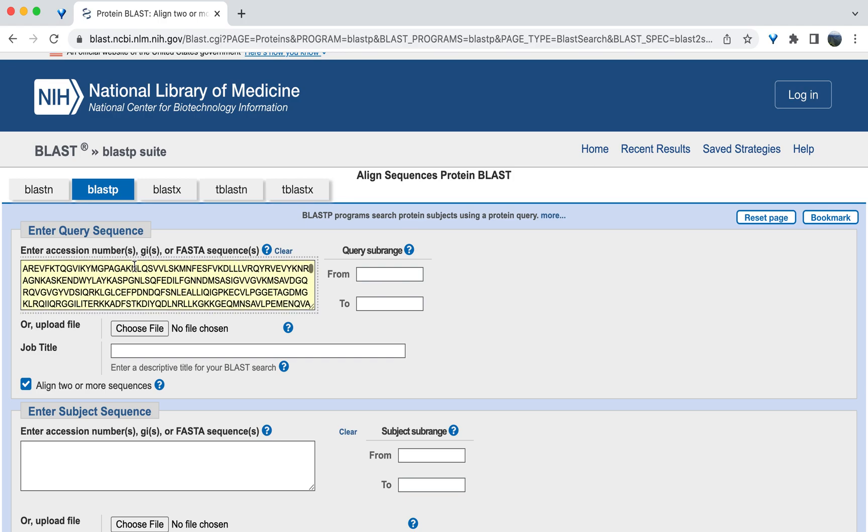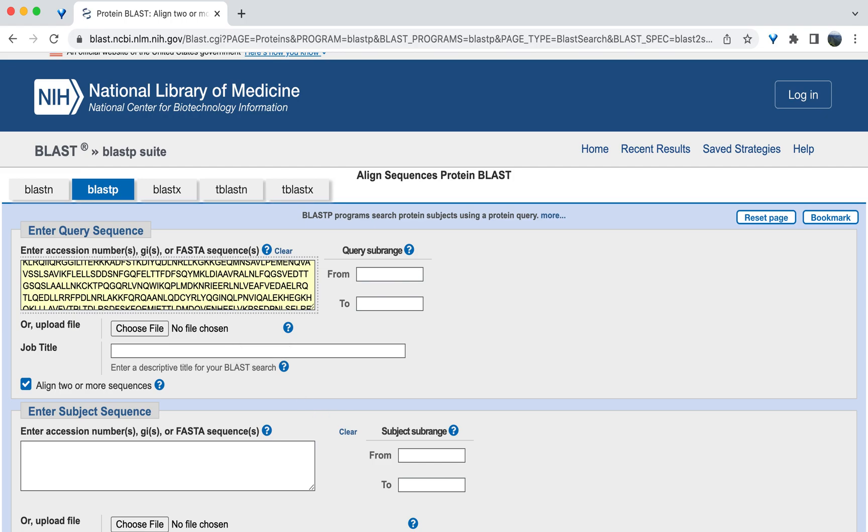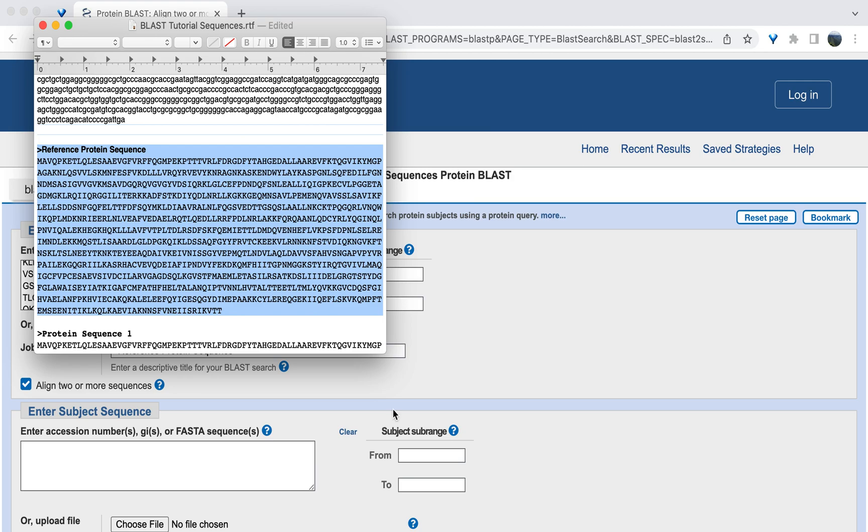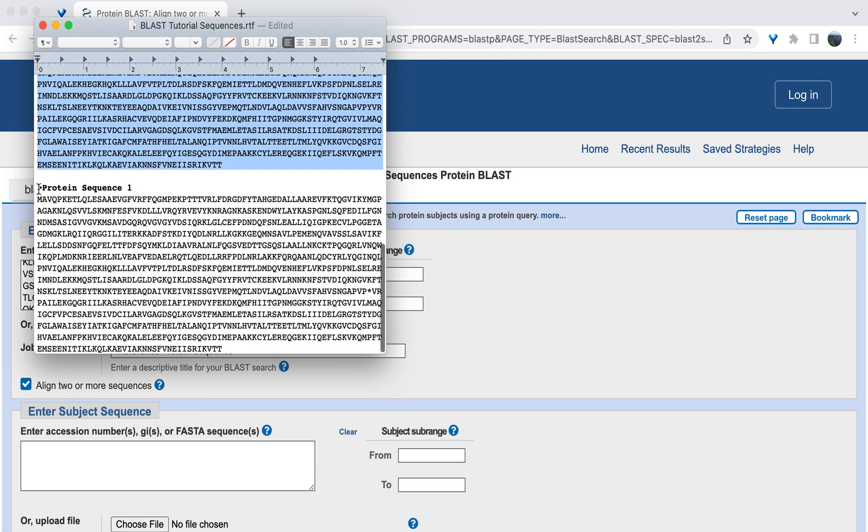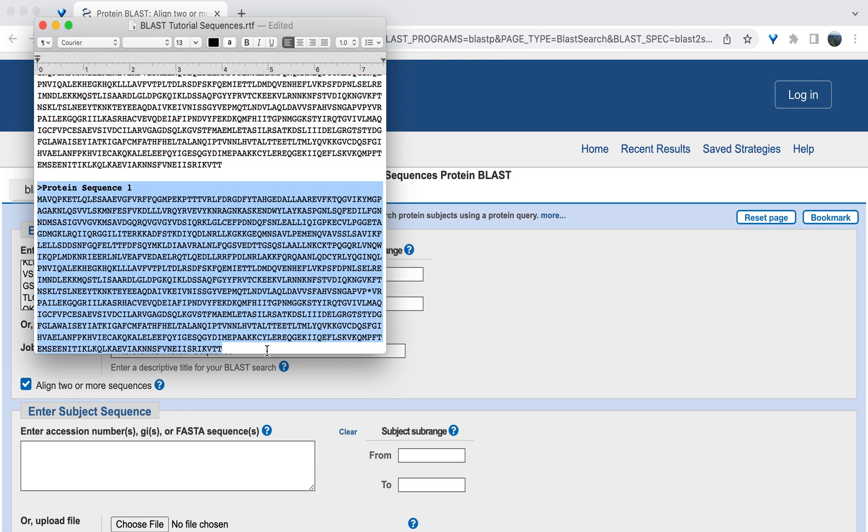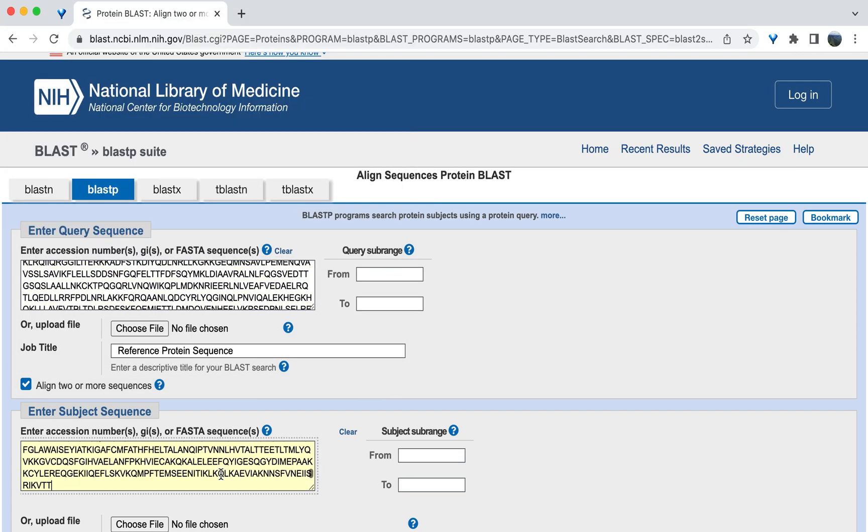Then copy and paste the other protein sequence into the box that's labeled enter subject sequence. You can enter one sequence into this box or multiple sequences. If you are entering multiple sequences, you can put them in one after another, each starting with a description line. It is important to include the description line because this will help you distinguish between the two sequences once they have been aligned to the reference. So our second sequence. Copy and paste.